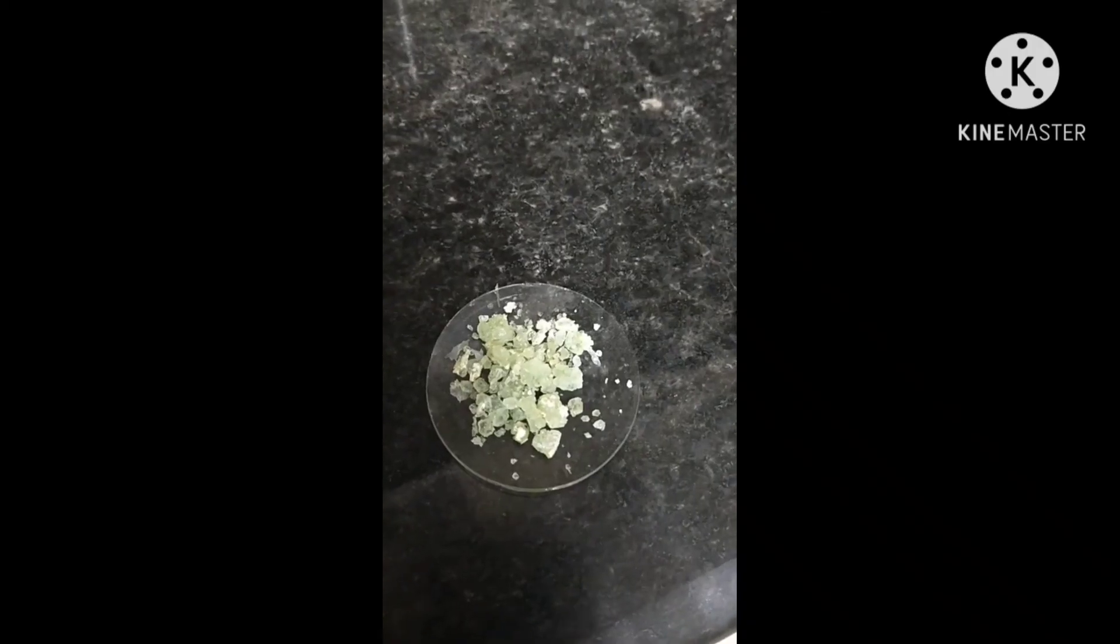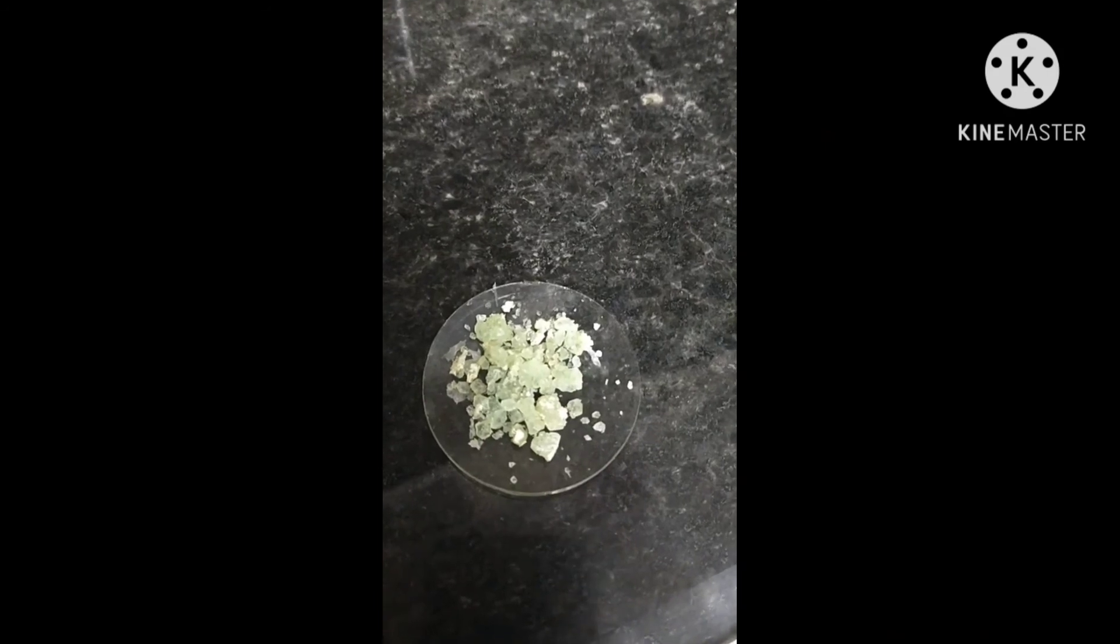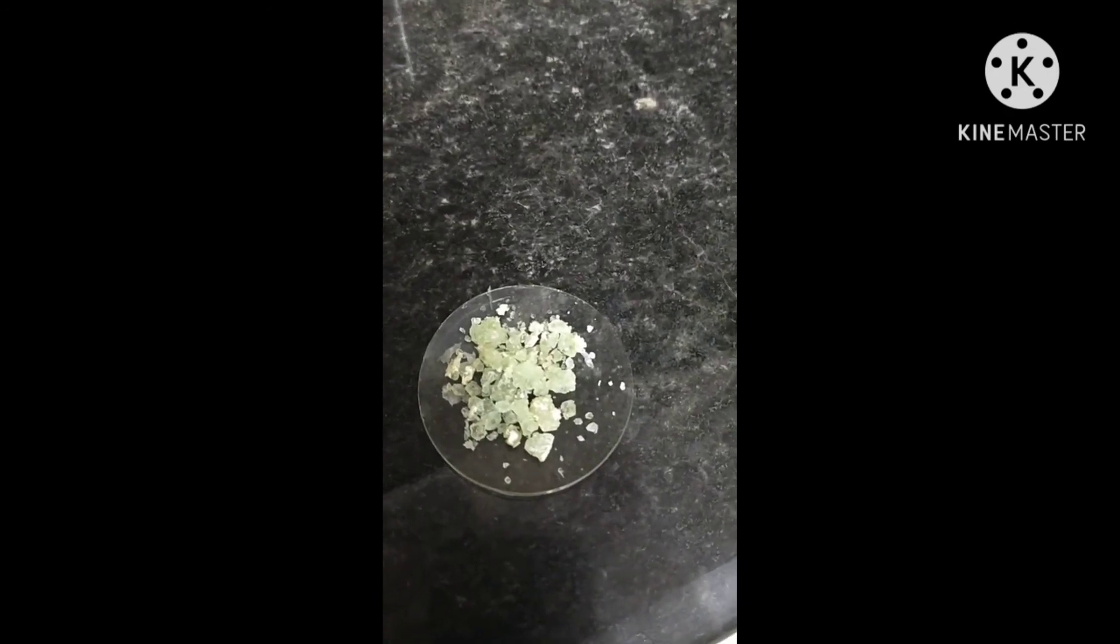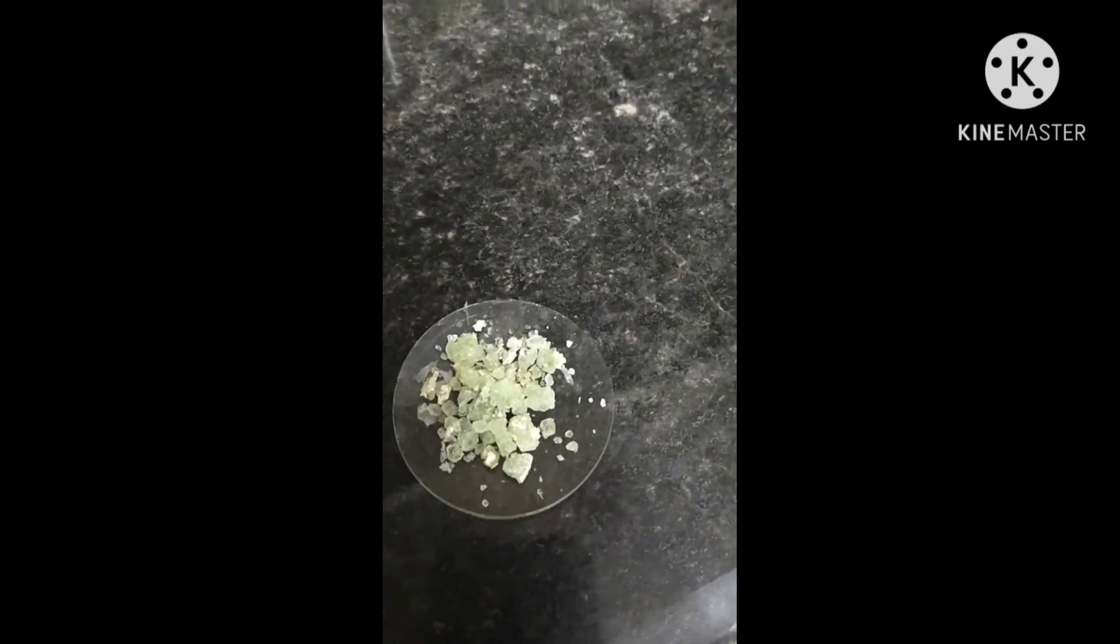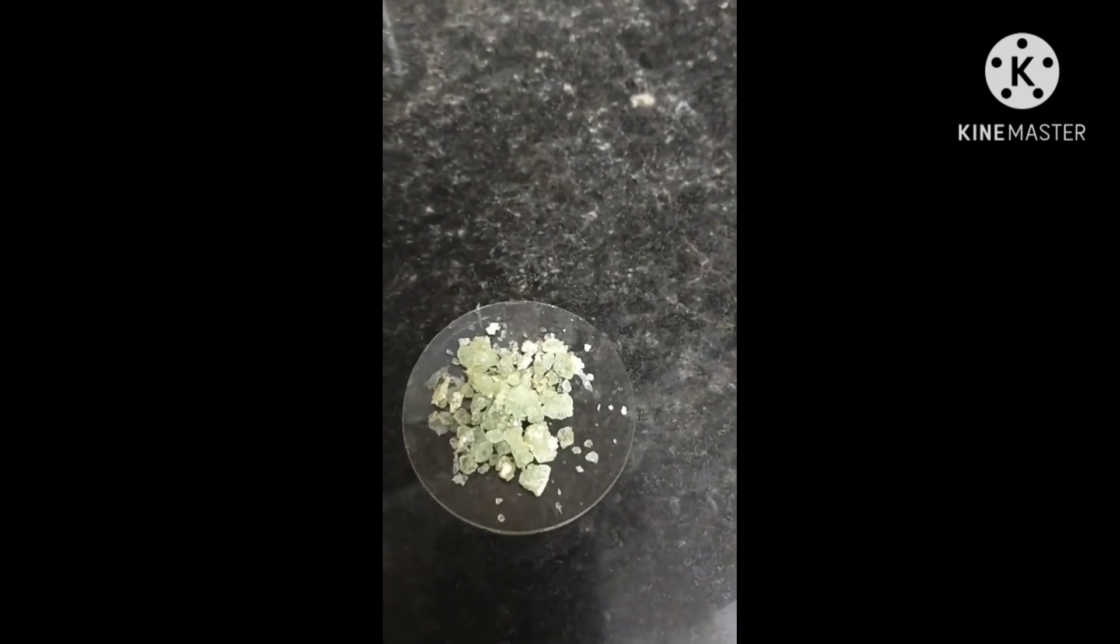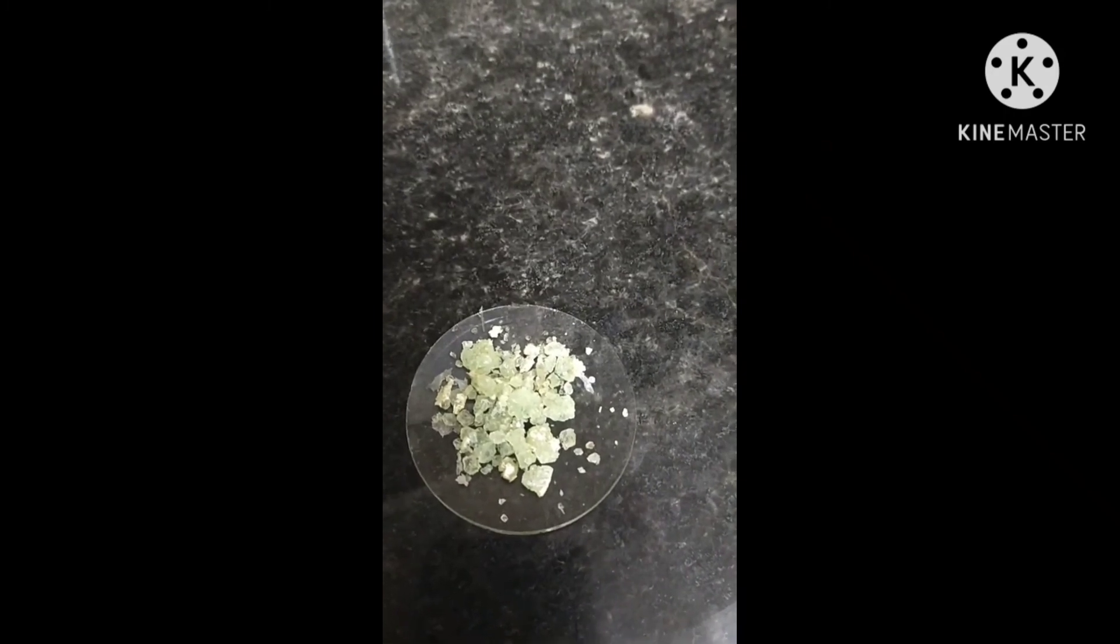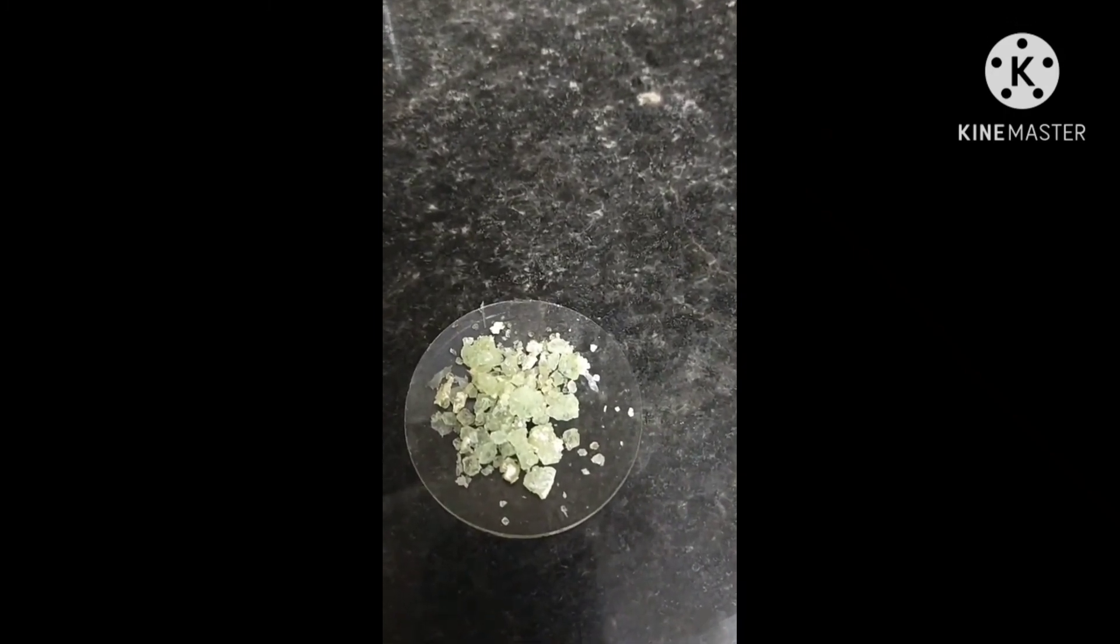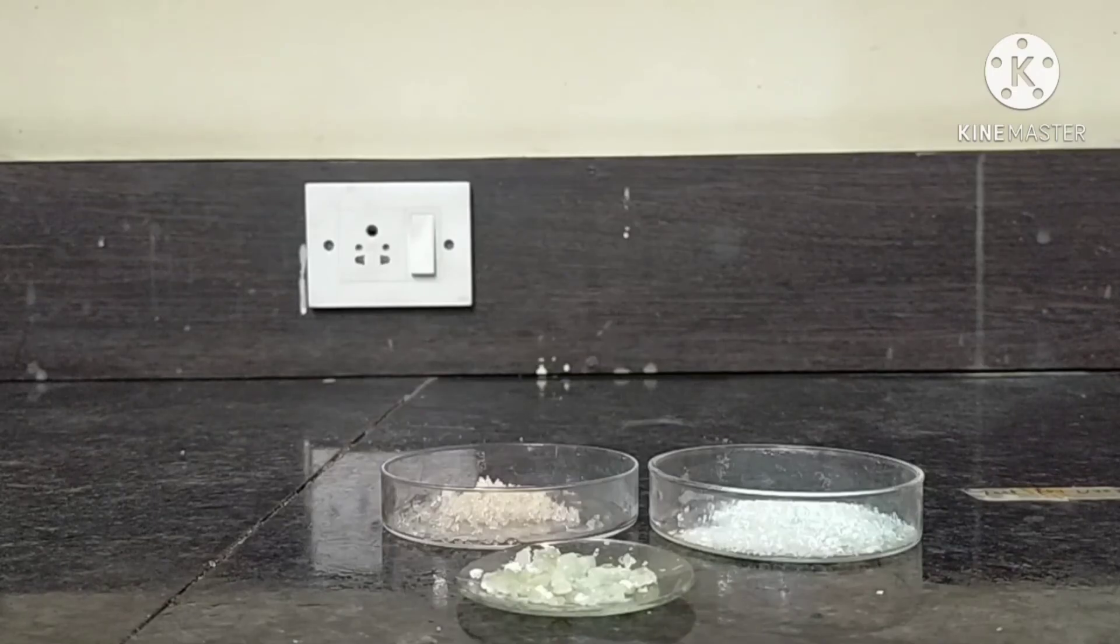After drying the crystals, we observe that the yield of ferrous ammonium sulphate crystals is 3.8 grams. The color of ferrous ammonium sulphate crystals is pale greenish. The shape of ferrous ammonium crystals is monoclinic.